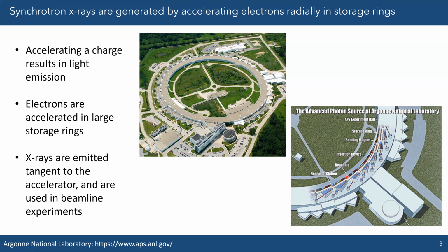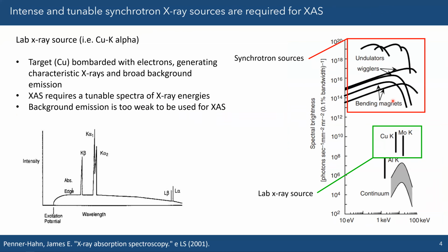All right. Any other questions? Yeah, one thing to add on that: you need to know the energy range you need, since different synchrotrons have different energy ranges. The ALS can only do soft X-rays. It can only do low energy X-ray experiments. It doesn't have hard X-ray capability.